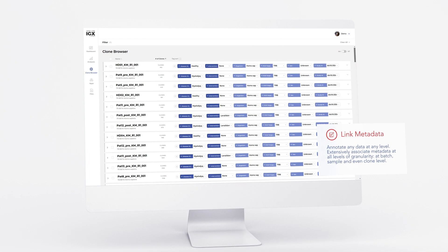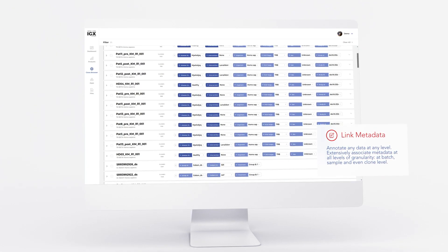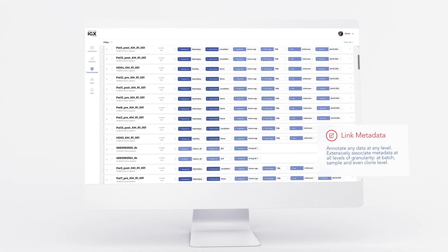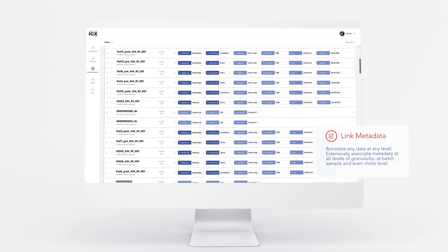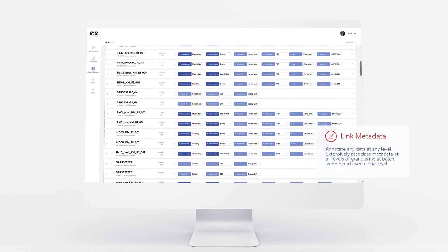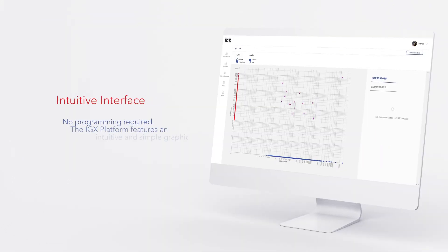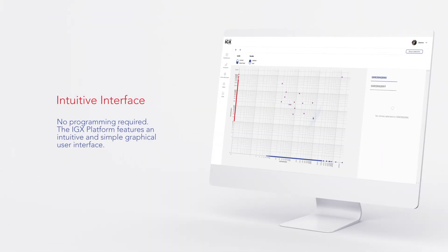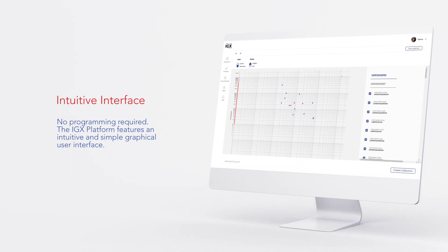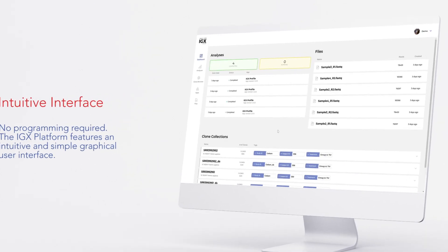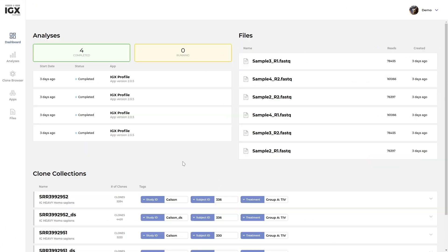You can tag sequences with clinical parameters such as disease diagnosis or response, but also experimental results like receptor affinity. The intuitive user interface allows you to quickly organize your data, find what you're looking for, and make the most out of your repertoire sequencing experiment.